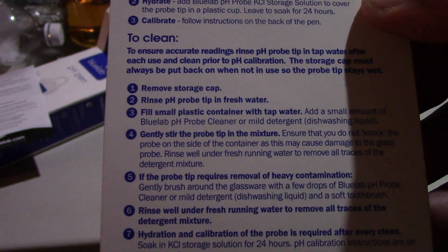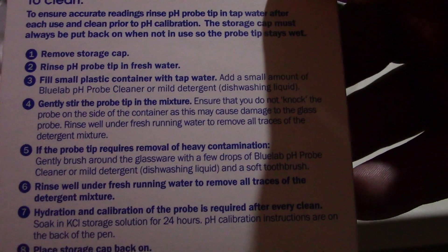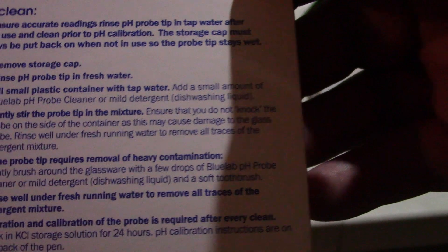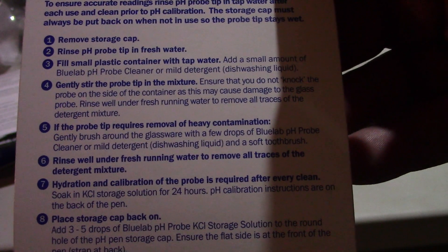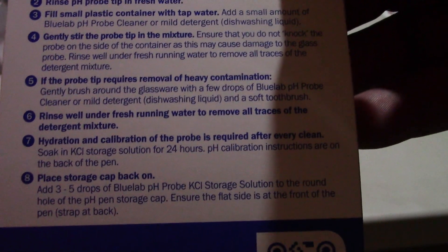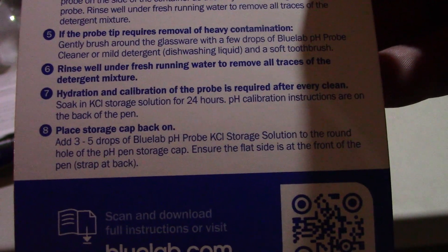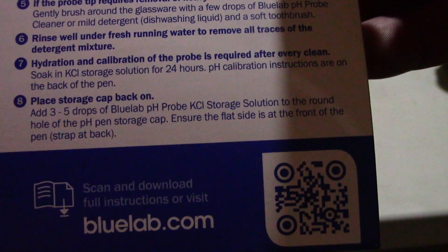So before use, here are the directions on how to clean: remove the storage cap and rinse the pH probe tip in fresh water. Fill a small plastic container with tap water and a small amount of Bluelab probe cleaner or mild detergent - dishwashing liquid works. Gently stir the probe in the mixture, ensuring you do not knock the probe on the side of the container as this may cause damage to the glass probe. Rinse well. For heavy contamination, gently brush around the glass with a soft toothbrush. Rinse well with water, then hydrate and calibrate - soak in storage solution for 24 hours. Place storage cap back on and add three to five drops.